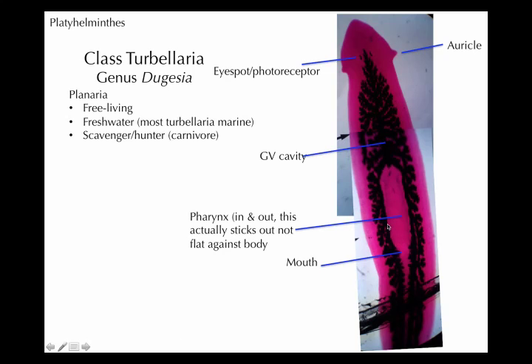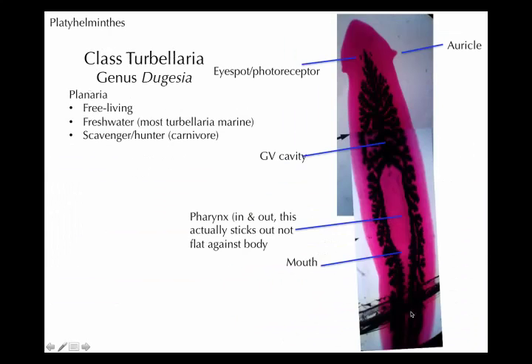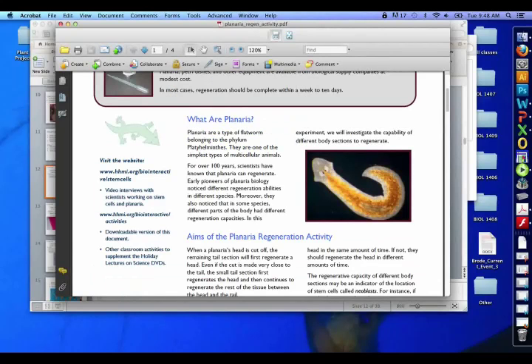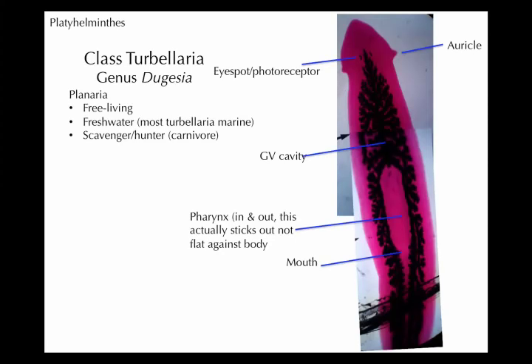This empty part here has no gastrovascular cavity, because that's actually the pharynx. You can see it's attached right here, and it would actually flop out like a tube for a mouth — this is its mouth-anus, the end of it's there. The tube is the pharynx, and then it goes into the gastrovascular cavity and gets digested and distributed. The mouth is not at the anterior actually — it's on the ventral, almost mid-section of the animal. One hole in and one hole out — gastrovascular cavity, that's how they work.